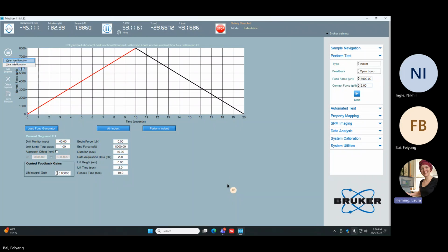Oh yeah, standard load functions. Oh, this works too, sorry. There's a little lag, so you're beating me. And then basic QS trapezoid. Oh, I'm sorry. Can you see the screen? Yep, it just was lagging, and so there was a little bit of confusion. But go to standard load functions, basic QS trapezoid at the very top.